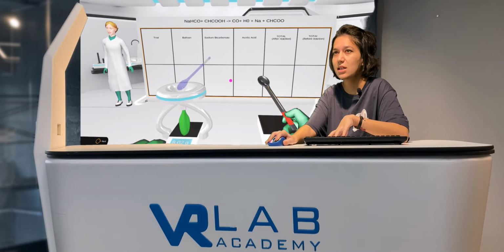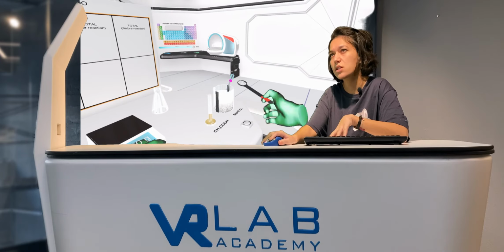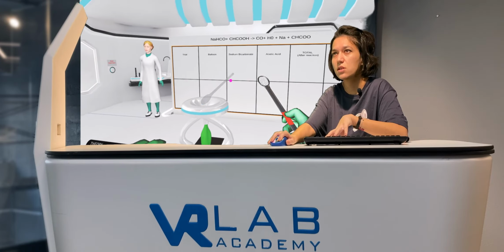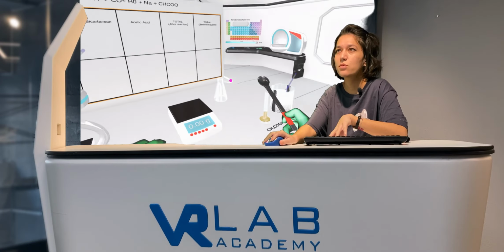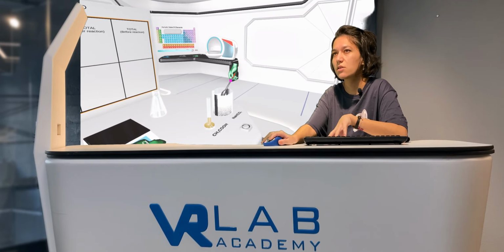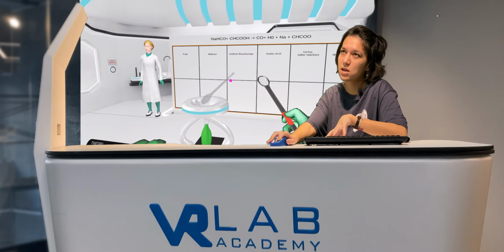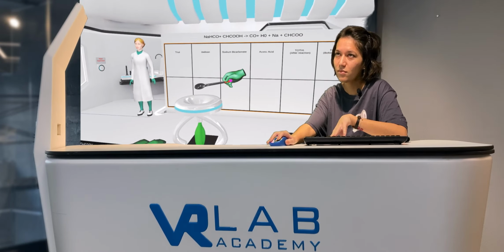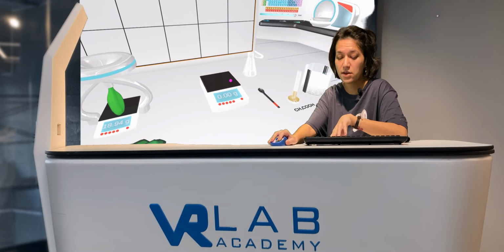I right click, take the spoon in my hand, click on the blue region, take some sodium bicarbonate, put it inside the balloon, right click, take the spoon, put it inside the sodium bicarbonate, take some sodium bicarbonate and put it inside the balloon. I right click to leave the spoon on the table.